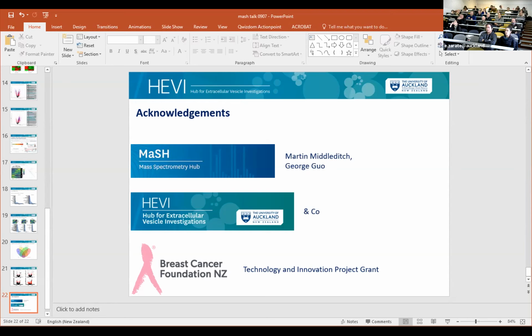We managed to also do MS-MS. This is another level of validation, where the parent ion is fragmented into fragment ions, and then we can see and get that extra level of validation to see if these compounds are correct. You can only really do this on the more abundant ions in the case of molecular imaging, but it seems to work pretty well, particularly for the anthocyanins. So it's just another level of validation that what we're seeing is what we think we're seeing.